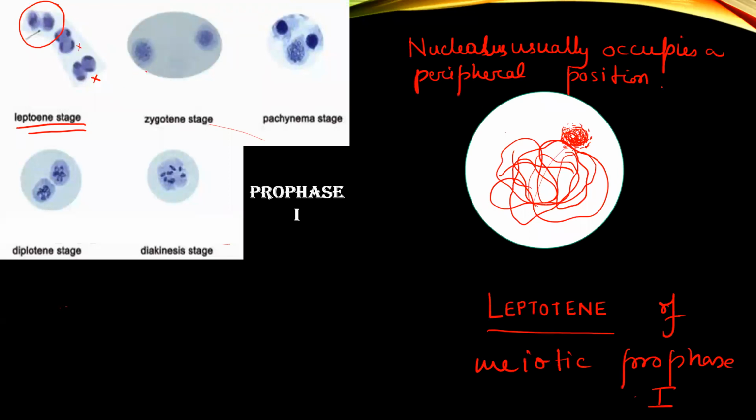Now see, homologous chromosomes now appear in pairs. A distinct nucleolus will also be here now. The nucleolus is quite distinct. If you look back once at those photos, the last slide, nucleolus is visible here. So it is prominently visible. Hence, this substage is called zygotene.